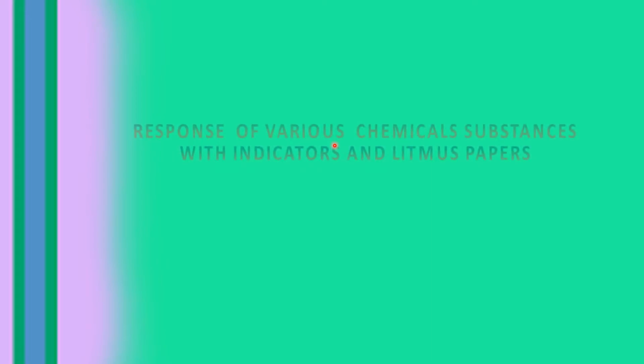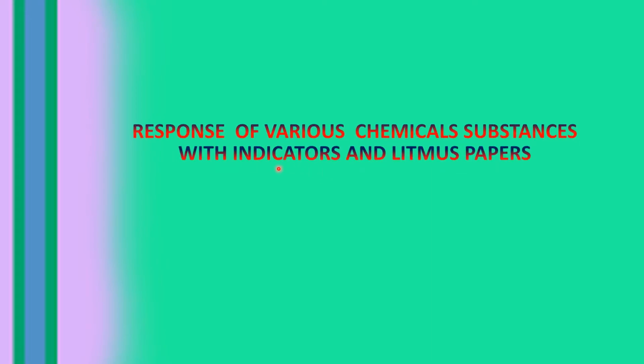Those chemical substances, how they respond with indicators and litmus paper. The indicators I am taking are methyl orange and phenolphthalein, and the blue and red litmus papers I'll take and show you with a small activity. Okay, now let us see.